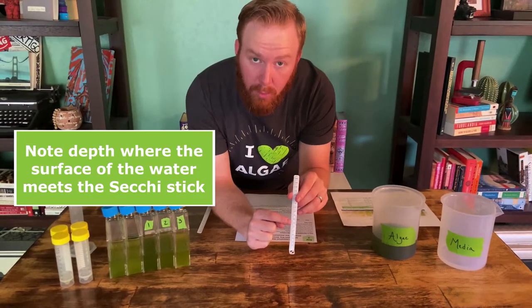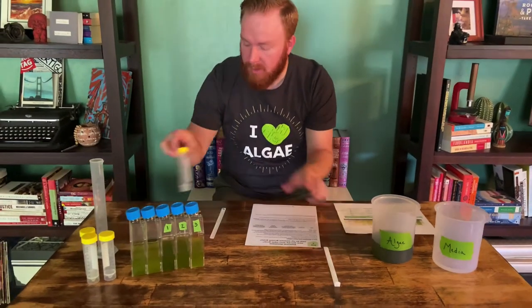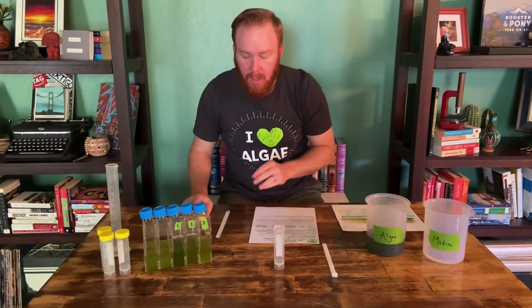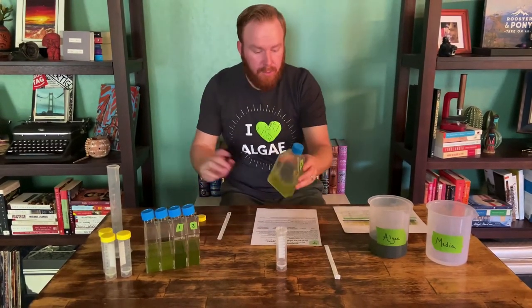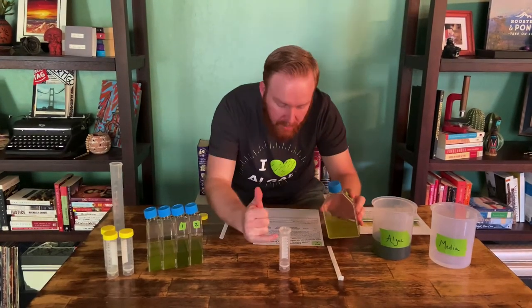When the shield disappears, we'll hold the stick steady. We're going to be reading the ruler part of the SecchiStick. So this is a skirted falcon tube, and what we're going to do is take an algae culture and fill it up to 50 milliliters, which is the line right here at the top.